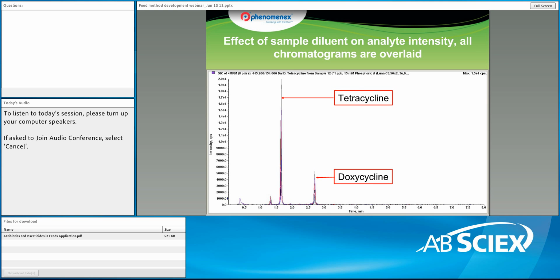We made 5 different solutions, with different acid strength and different pH. In this case, we're looking at the chromatography to make sure there's nothing that these acidic solutions will do to the peak shape. I have overlaid all of these peaks, and as you can see, there's nothing that makes them any different, no unusual peak shape or difference in the retention time.